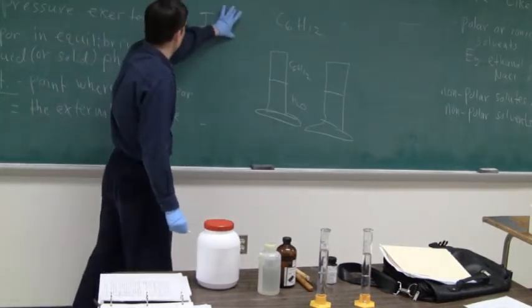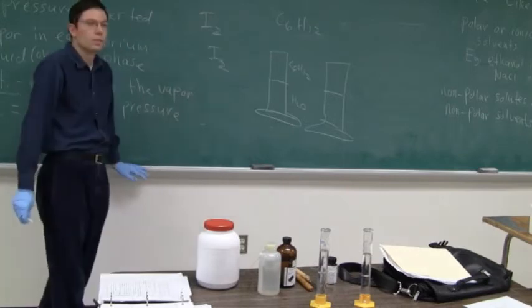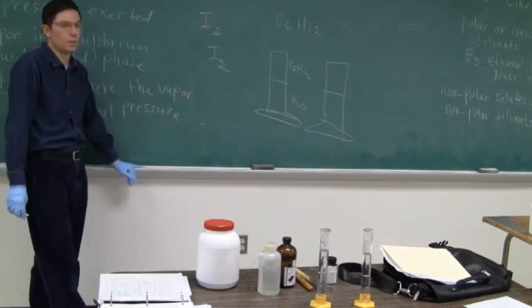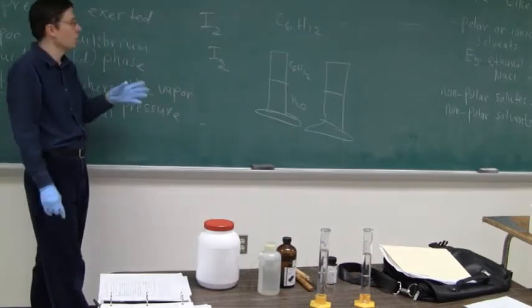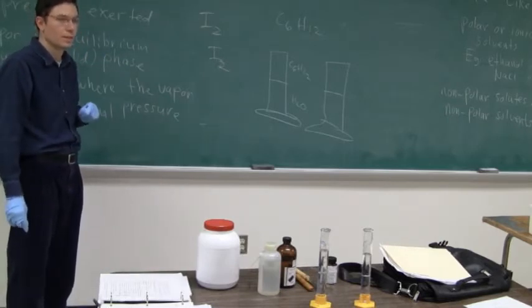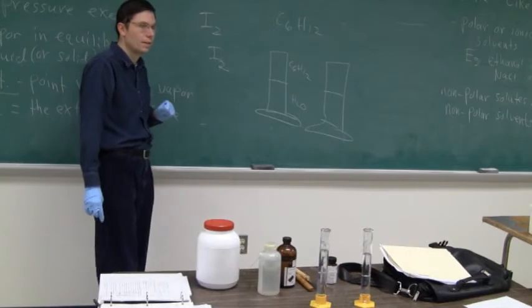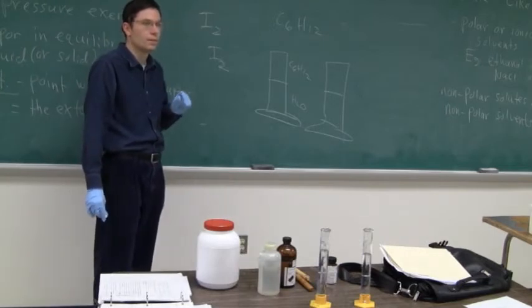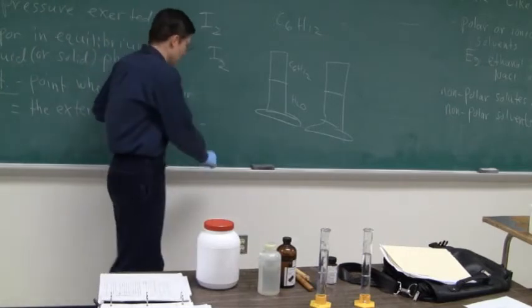Now, question. What type of compound is I2? Meaning, is it polar or nonpolar? Nonpolar. Okay, so where should it be? Let me throw it in here. What's your layer? C6H12. Okay, so let's see what happens.